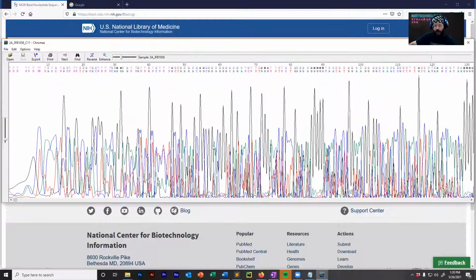When we look at the chromatogram, you can see exactly what I was talking about, where in individual bases you have a bunch of these N's. N is where it can't determine what the base is because there's a high blue peak and a high red peak. And here there's a high green peak, a high blue peak, and a high red peak. So it has no idea what the sequence is. This is essentially bad sequence data. This is trash. So we got no results for the second hit. I just wanted to show this as an example of bad sequencing data.